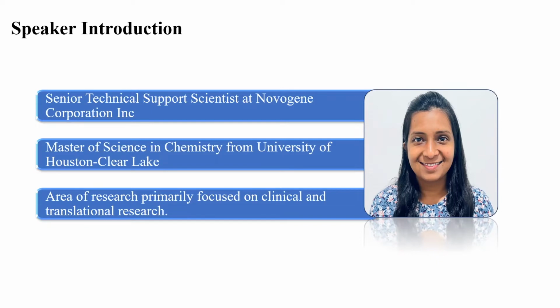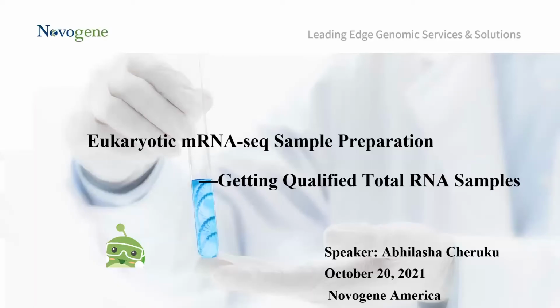Thank you, CB, for your introduction. And I would like to thank everybody for joining today's session. Let's get started. Today's topic is eukaryotic mRNA-seq sample preparation and getting qualified total RNA samples for our RNA-seq.